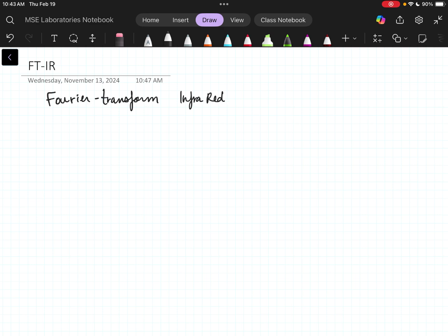FTIR stands for Fourier transform infrared. Have you heard of Fourier transforms? No, I don't think so.